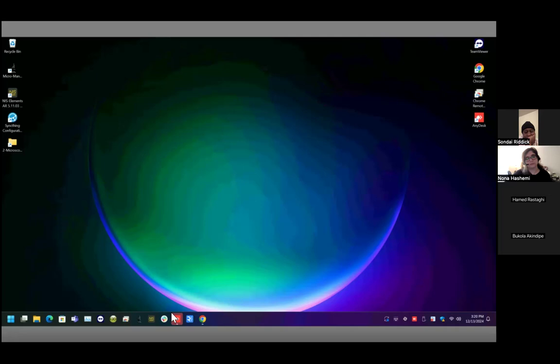You guys are mostly in the lab, right? You have to get into the lab to do everything you want to do physically. You don't have to remotely connect to the computer. Most of the time we are just recording our data from the microscope to the computer, and for the rest, we are doing the microscope data set analysis here, I think. It's recorded physically in that room. All right.